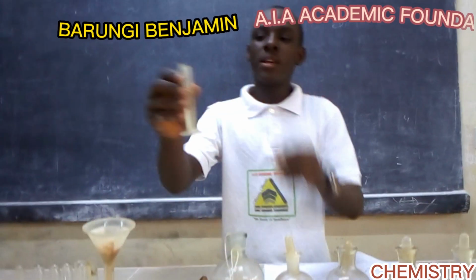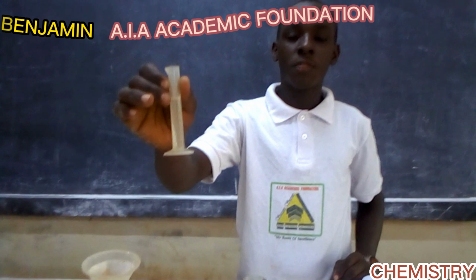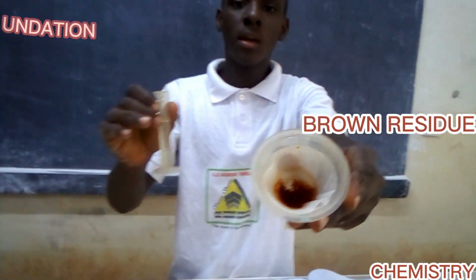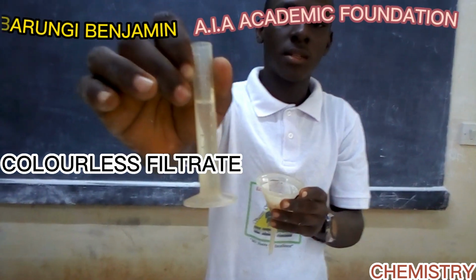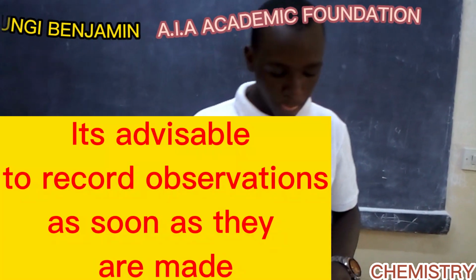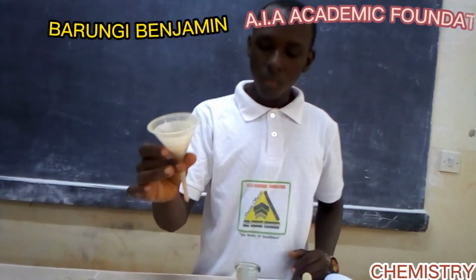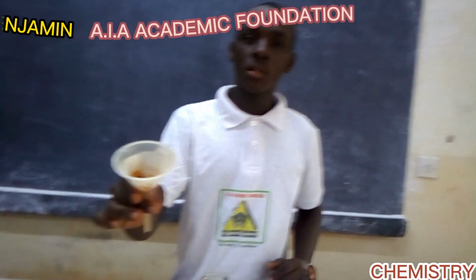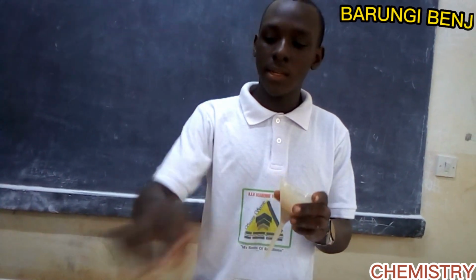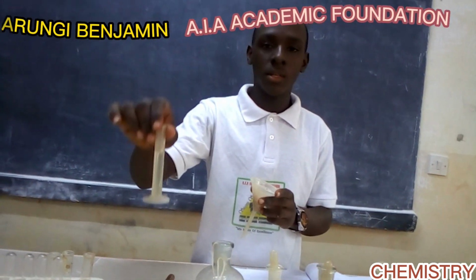We have obtained our filtrate after filtering, and our residue is brown in color and our filtrate is colorless. So as you record in your observations, you say after filtering, a brown residue was obtained and a colorless filtrate was obtained.